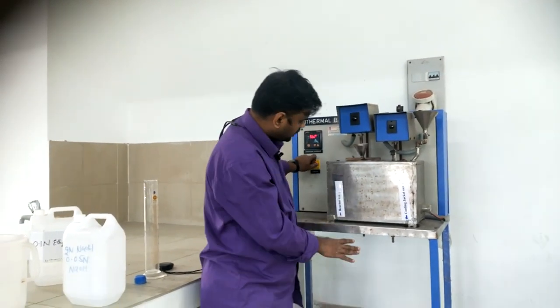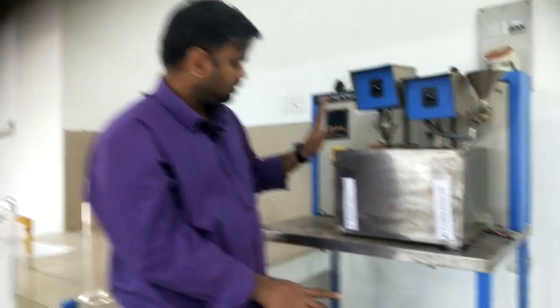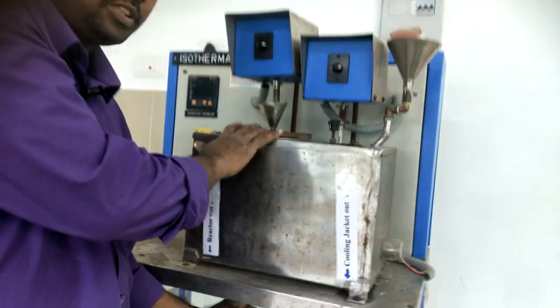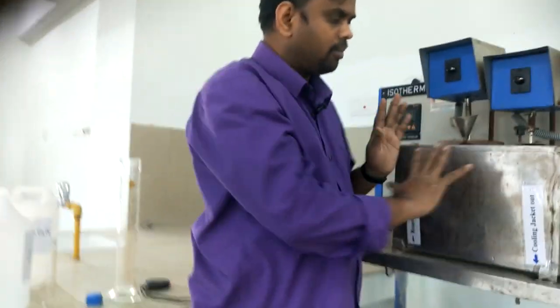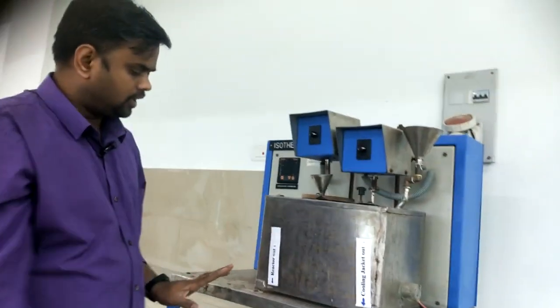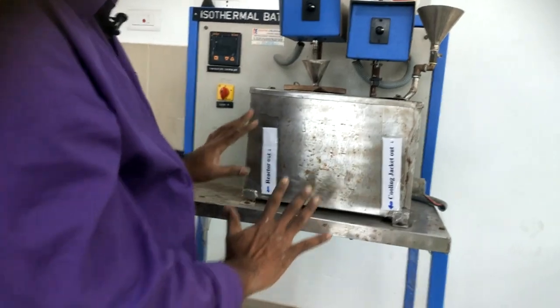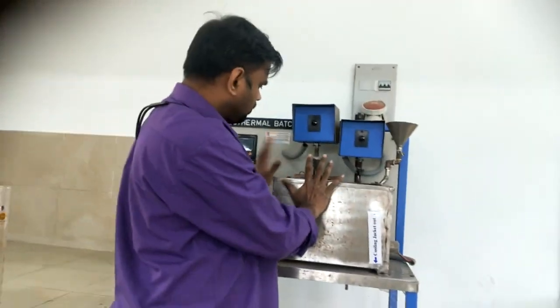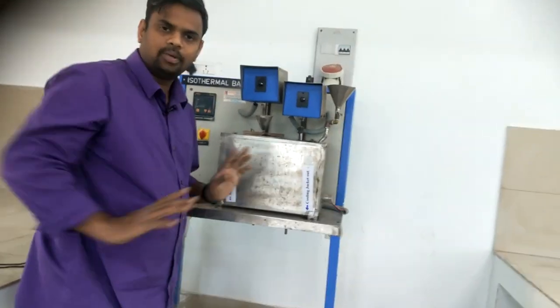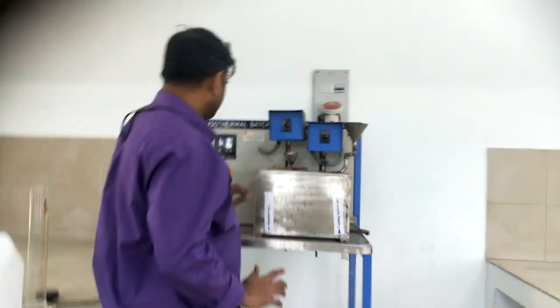Once we have completed the reaction, we will stop this motor. Carefully, we will remove all the reactant from the system by opening the valve. Also all the cooling water has to be removed and kept dry. You have to clean the reactor and leave. All this is made of stainless steel, but still we should try to keep it clean. No water or reactant should be in the system once you complete the experiment. Thereby, we should take care of the safety precautions also.